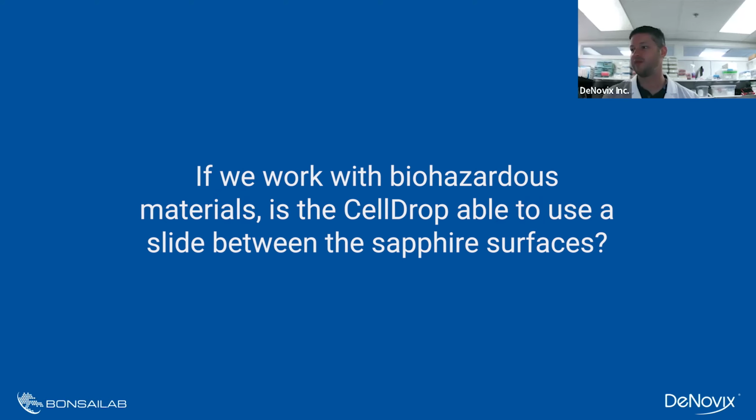Next question: if we work with biohazardous materials, can we still use a slide between the sapphire surfaces? Yes, actually, you can. One of the features that we built into the CellDrop is a groove that the reusable surfaces sit in that will fit a slide.